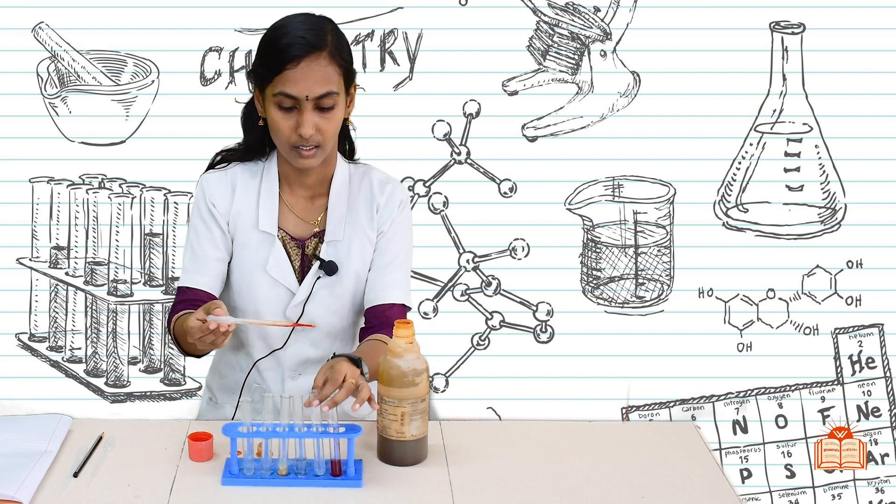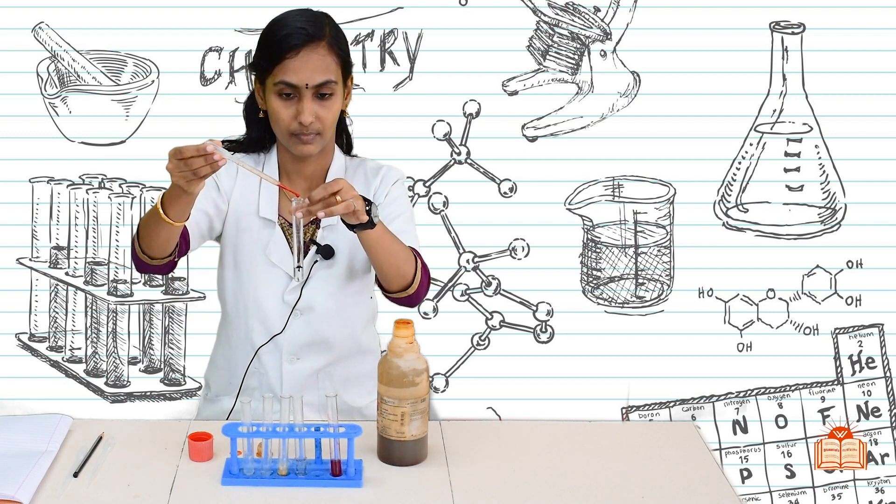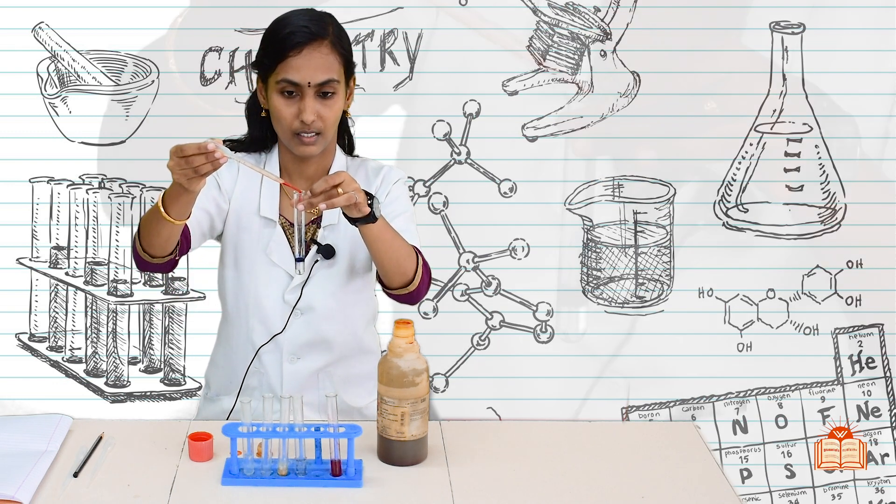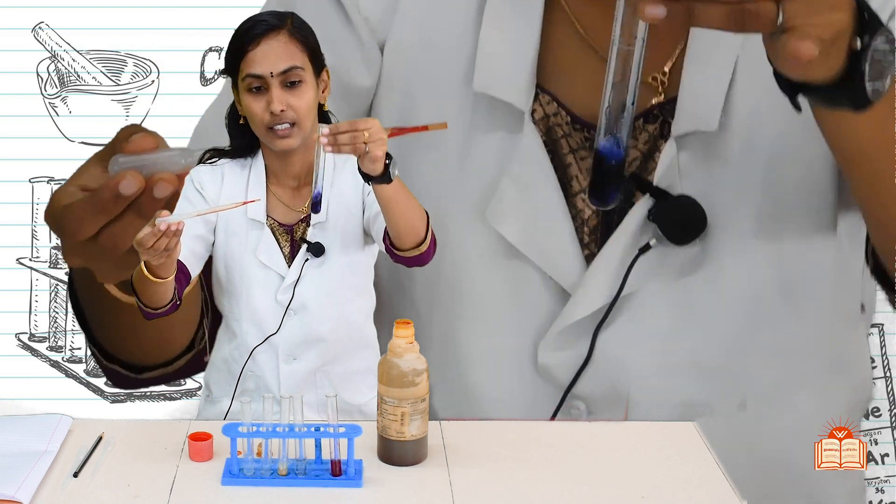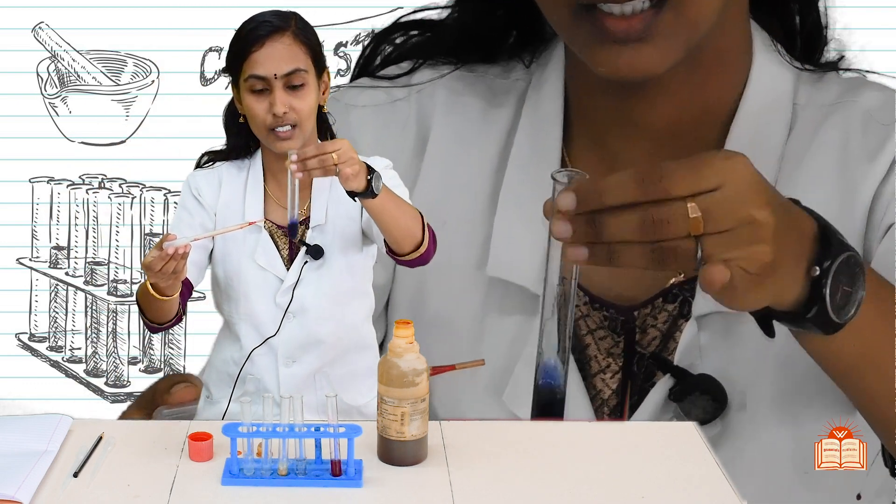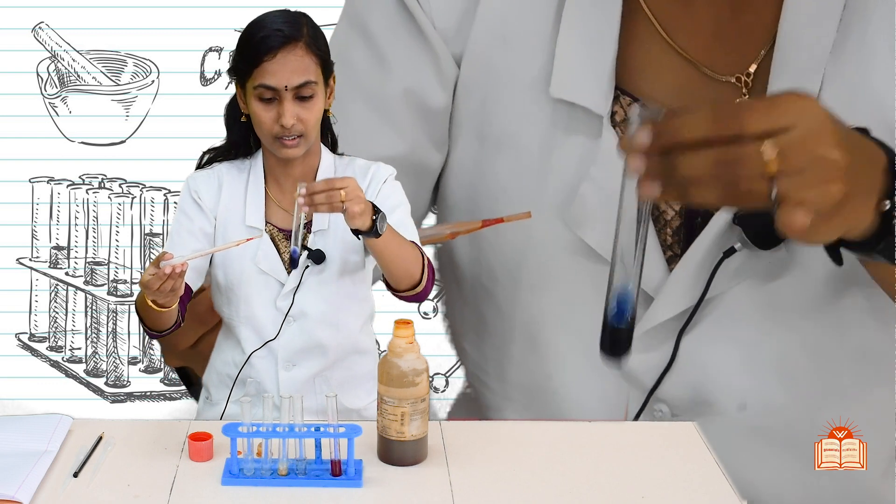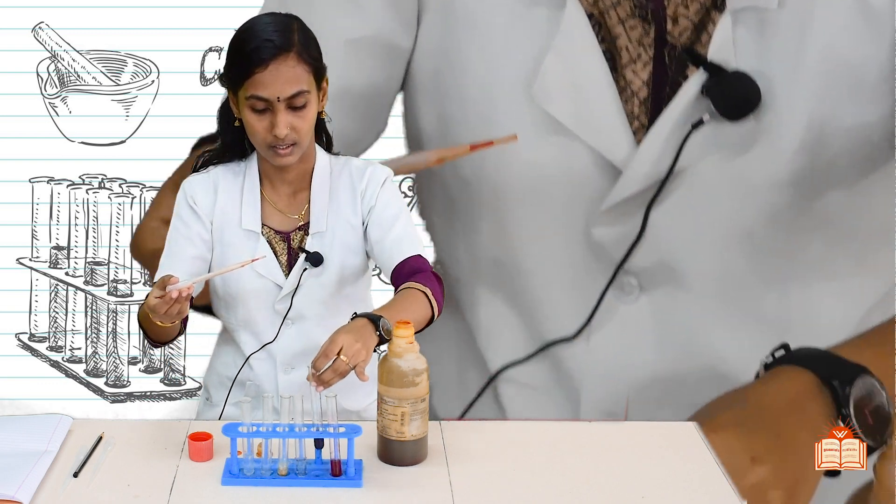Next one, dilute NaOH solution, add some drops and see the color. What is the color students? Note down these colors in your book.